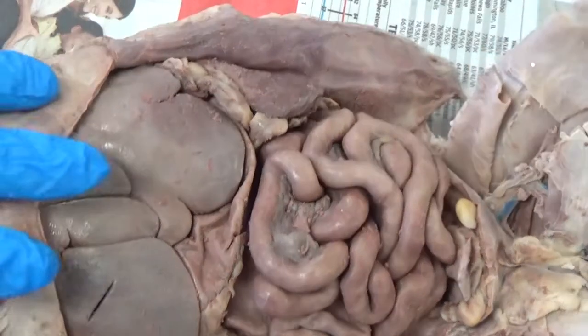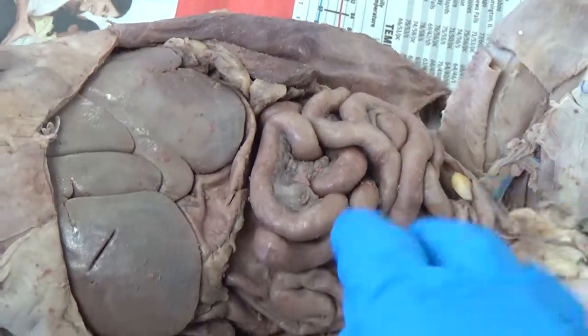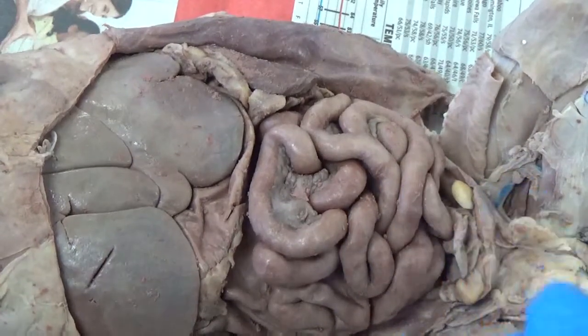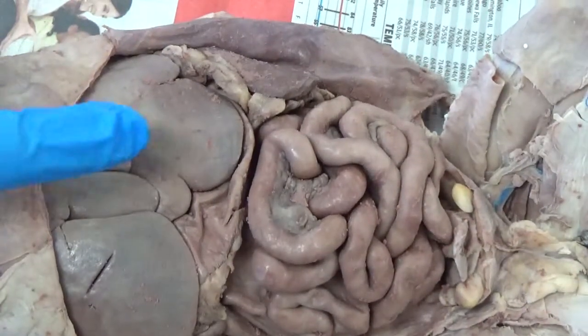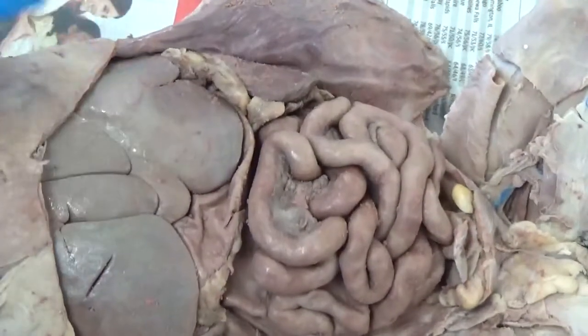Right here, this is the anterior portion of the abdominal cavity, and over here is the posterior. In humans, it would be different. This would be superior, and this would be inferior, because we have a different anatomical position.